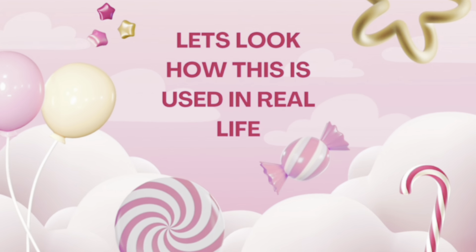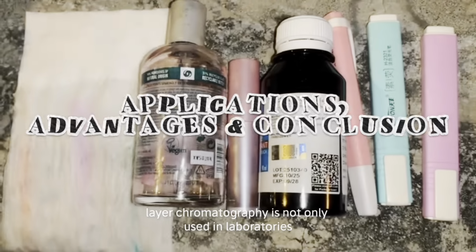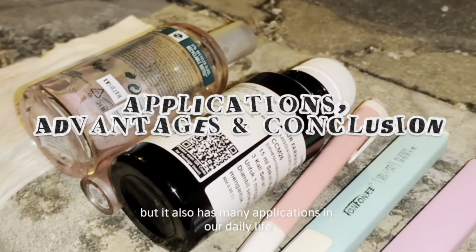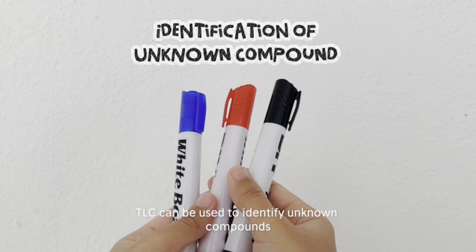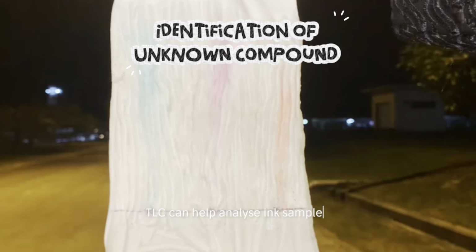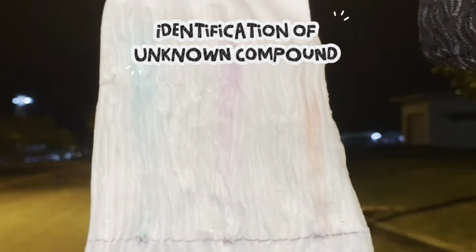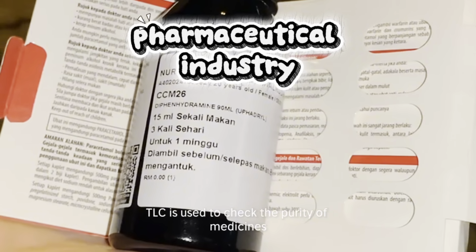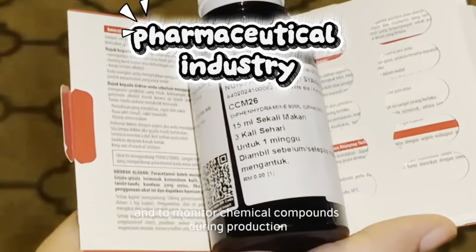Now, let's look at how this is used in real life. Thin layer chromatography is not only used in laboratories, but it also has many applications in our daily life and different industries. For example, TLC can be used to identify unknown compounds. In forensic science, TLC can help analyze ink samples from documents or compare different inks. In pharmaceutical industries, TLC is used to check the purity of medicines and to monitor chemical compounds during production.